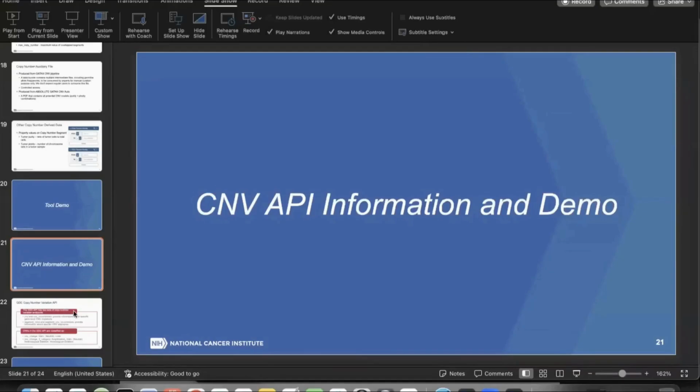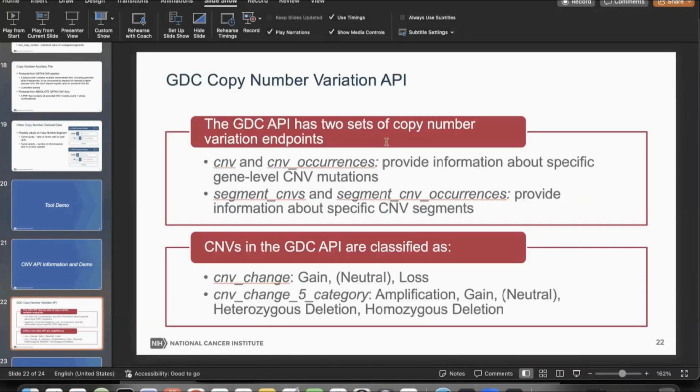All right, thanks, Shin. Let me go ahead and get back to the presentation here. I'm not going to go into the presentation mode because there's just one slide I need to show before we get into the demo. And that's this one here.